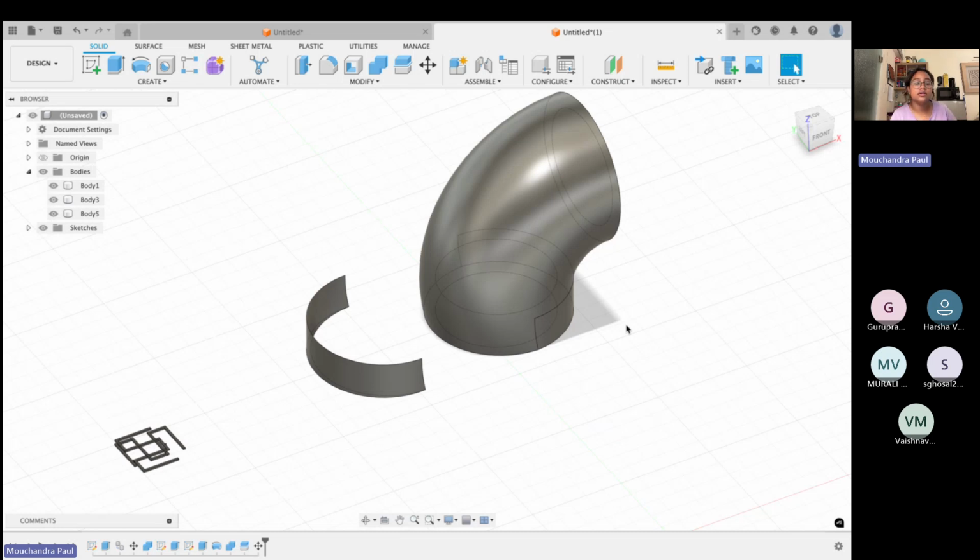All right, and if you have any more queries, I'll give you an assignment. I'll give you one assignment to create a very simple lattice structure to help you get started. In the meanwhile, you can also try on your own to create more and more structures. Let's say you want to create a pen holder, or a bottle like this. You can create it here in this CAD model. Any realistic object that you see around yourself and you want to practice, you can take that object as an inspiration.